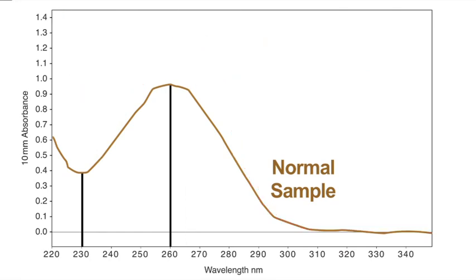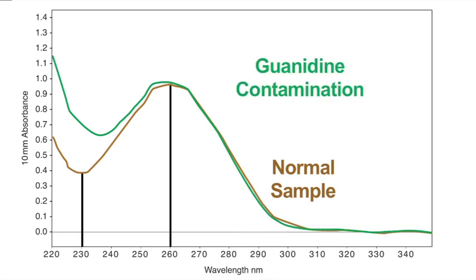Conversely, residual guanidine from column extraction may contribute to a peak near 230 nm and a shift in the trough from 230 nm to approximately 240 nm.